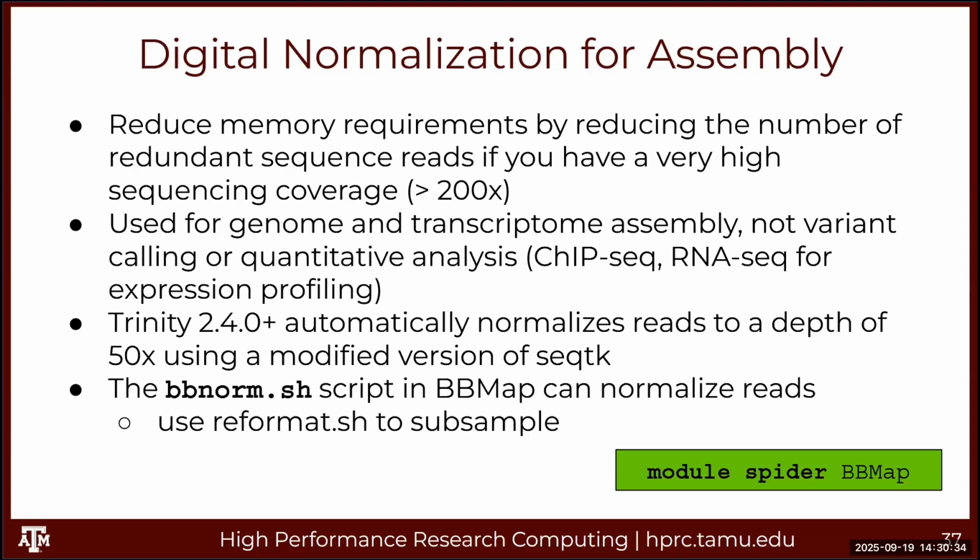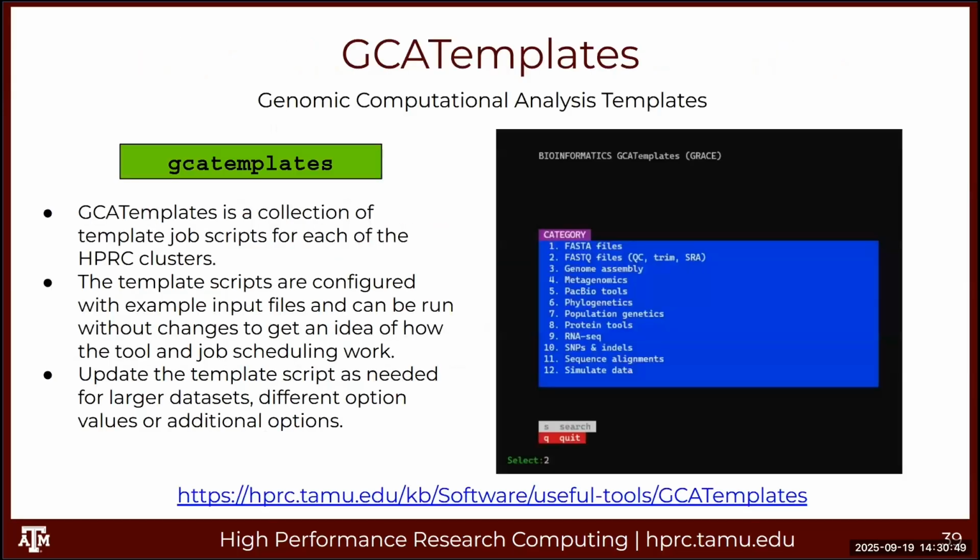Trinity now by default will normalize reads to a depth of 50x instead of trying to assemble 200x. It doesn't need 200x, it only needs 50x. So it uses a software to do the normalization.